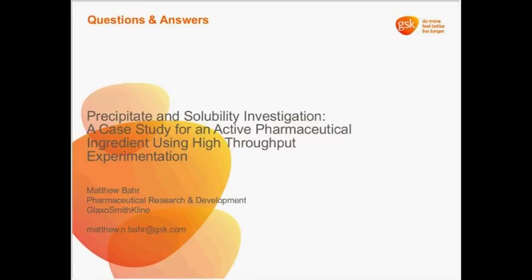The reason why I pick n equals 4 for a 1 hour experiment is because it does take some time for the robot arms to move over to the source plates and then to withdraw the liquids, bring them over to the filter plate, run that filtering process, and then go on to the next set of sample wells. If that process of filtering and daughtering and diluting takes more than 10 or 15 minutes, then I'm really no longer looking at a 1-hour experiment. I might be looking at something that could be 1 hour and 15 minutes. So I need to really keep that data as close to the time point target as I can.